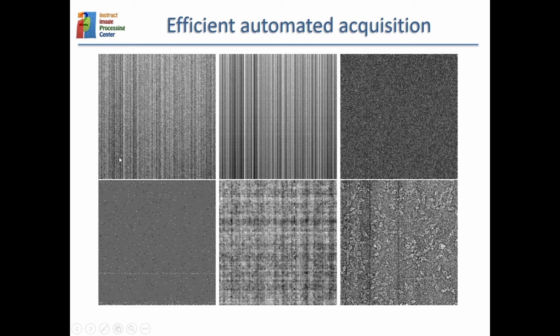This causes the same amount of electrons reaching two different points to be reported as different numbers of counts, because of the different local properties of the sensor, and they have different efficiencies. That is called the gain image, and this gain image can be measured experimentally, but it can also be estimated from the movie itself.